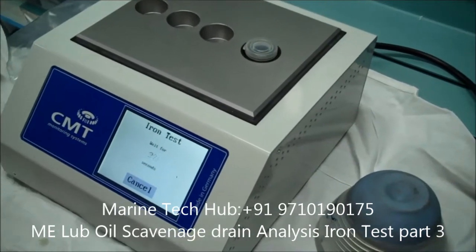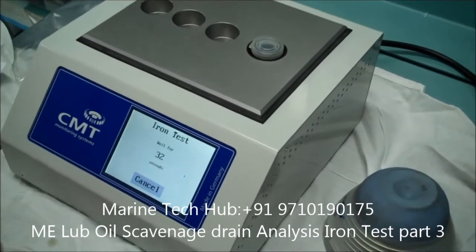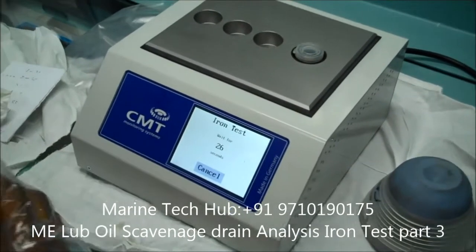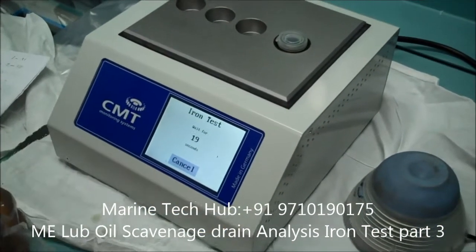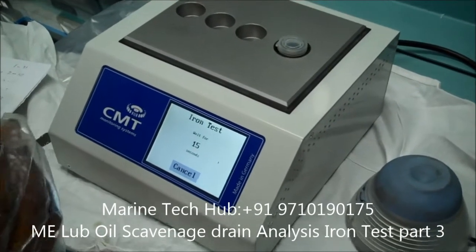How does this iron content help in the running of the main engine? Normally if your result is more than 200 ppm, it means you have some wear — wear down of liner or piston rings. The required value should be less than 200 ppm. If you get results less than 200 ppm, it means your wear down is less.